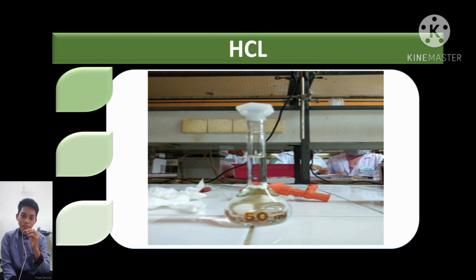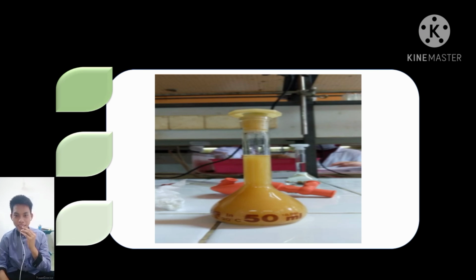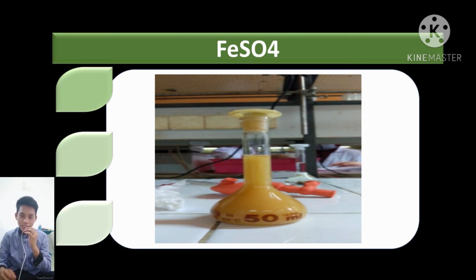This is a picture of hydrochloric acid experiencing a color change. The clear liquid substance turns into a liquid and cloudy. Ferrum sulfate, iron 2 sulfate, experiencing a color change: the blue substance turns into a thin yellow liquid solution.